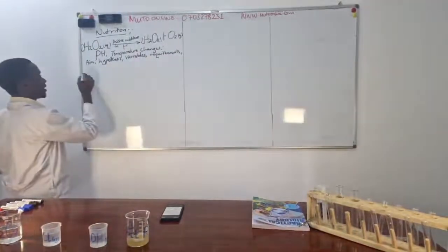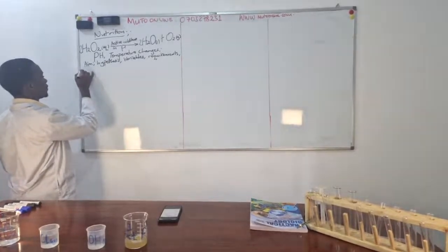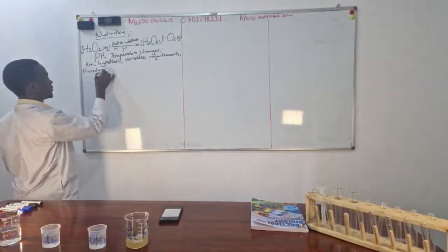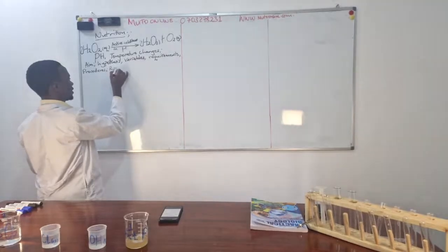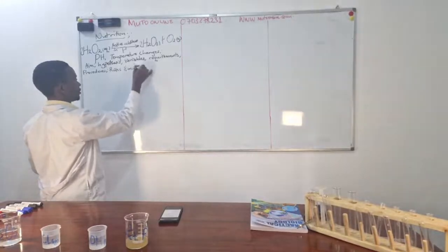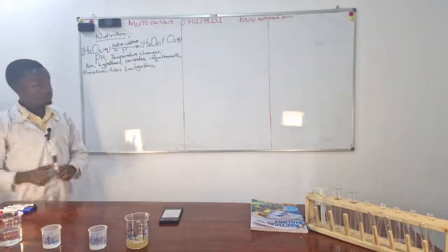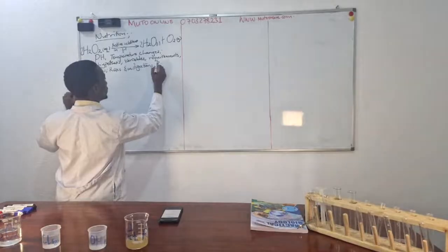We remember we have to state the procedures. We have to state any risk or sources of error and their mitigations. We have to give results.